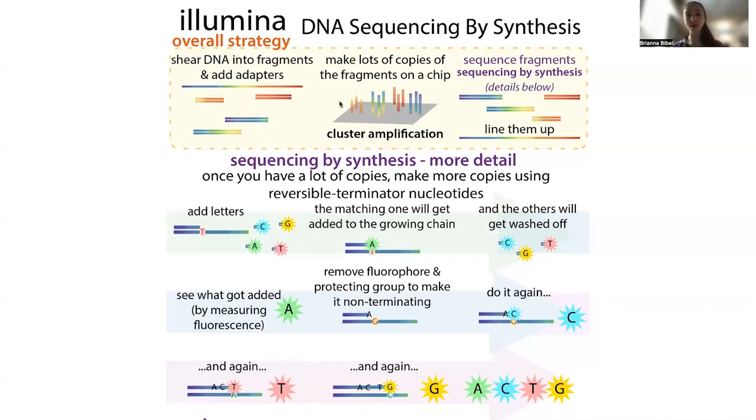And these adapters are going to make it so that these DNA pieces will hook up to a chip. And when they're on the chip, there's this complicated chemistry that's going to make it so that you're making lots and lots of copies of that different piece of DNA on the spot.